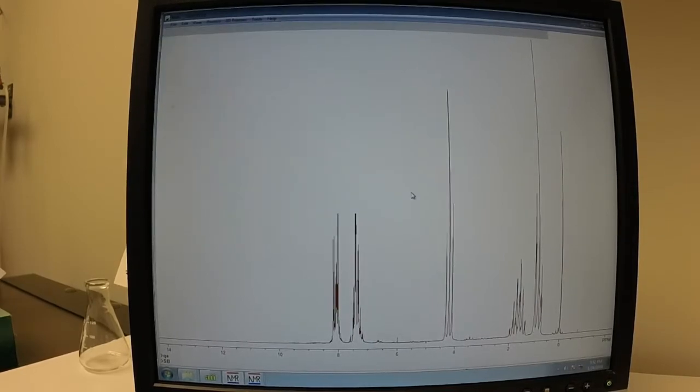The program is already on computers in Briar Computer Labs. You can also download the program to use it at home. You may now remove your sample and the thumb drive.